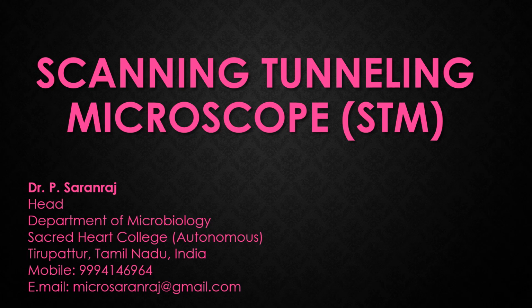Dear viewers, greetings. In this video, we are going to see about the scanning tunneling microscope. In short form, it is called STM.